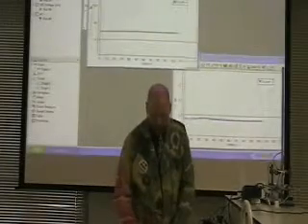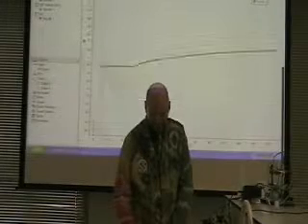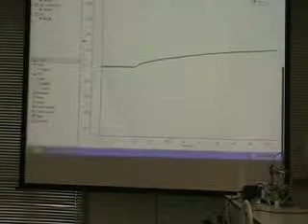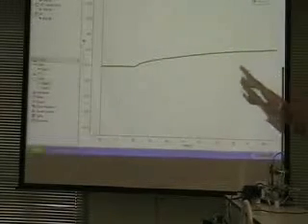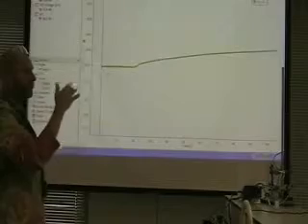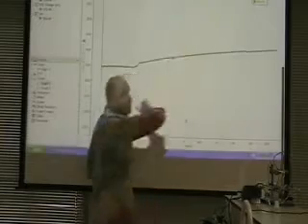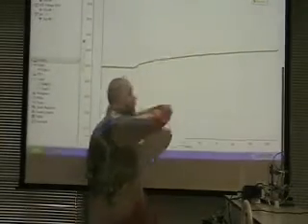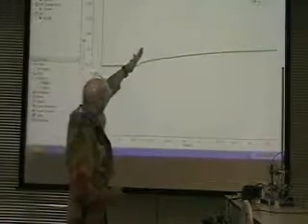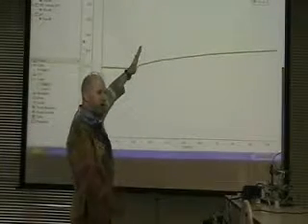Now, if we look at the first graph and blow it up, scale to fit, then you get more than what you thought. You do get a steady temperature rise. Now this looks a lot more similar to a graph that you see in a book, because the graph in a book is a curve that goes up and tends to begin to flatten out after a while. Now the best place to measure the rate for a reaction is right there at the beginning of that curve, because that's the rate when you know what the concentration is.